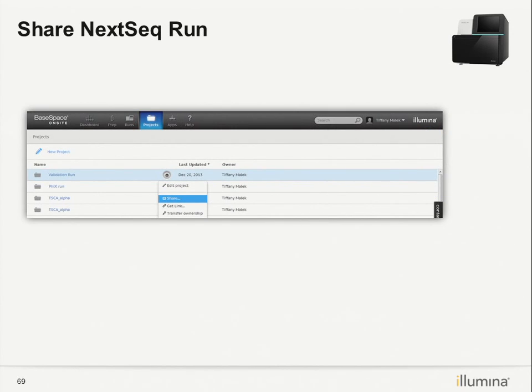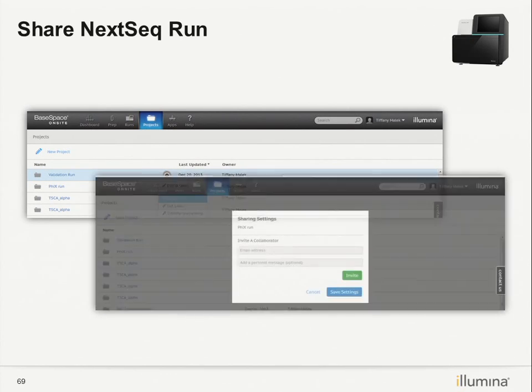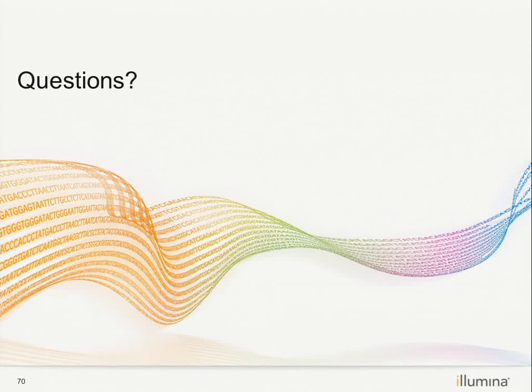Okay, and finally for the NextSeq, you can share the run with your collaborators. So just give the email address and then click invite, then they can accept the run. Okay. So questions so far? Okay, if no, then I'll hand over to Aaron.